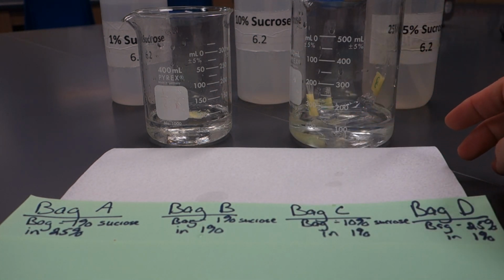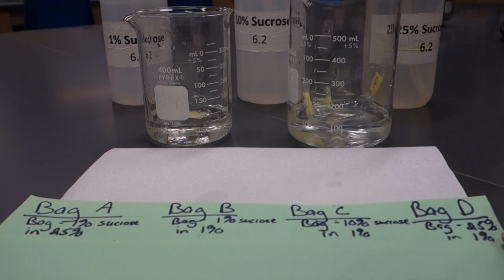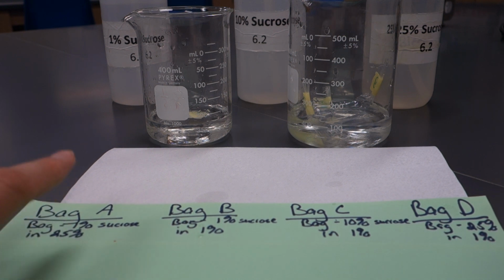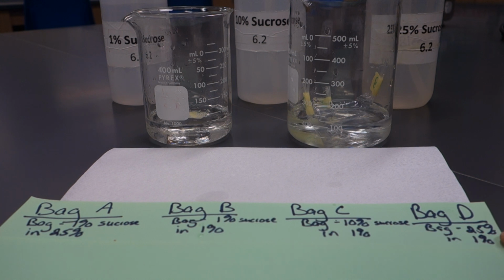That is because the 3 bags in here are all sitting in a 1% solution of sugar, whereas the first one is actually sitting in a 25% sugar. So it's a dramatic difference there. So bag A is a 1% solution of sugar inside of the bag and a 25% outside of the bag. Then bags B, C, and D are all in that 1% sugar solution.